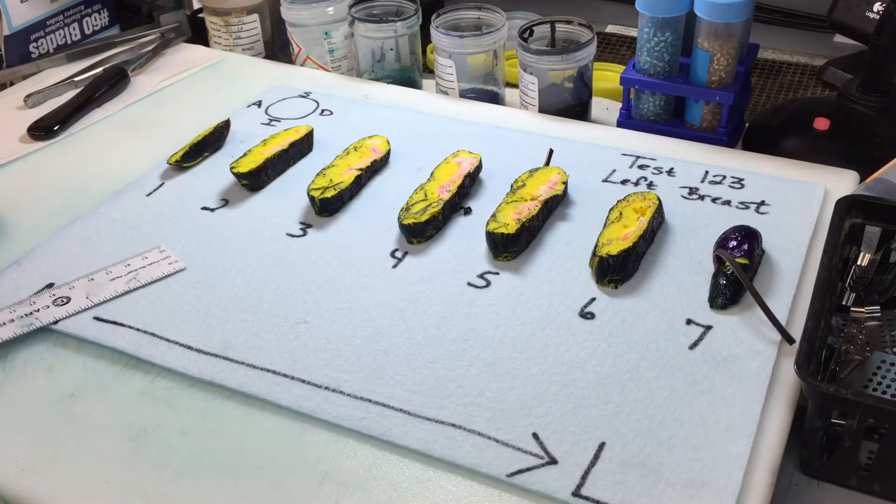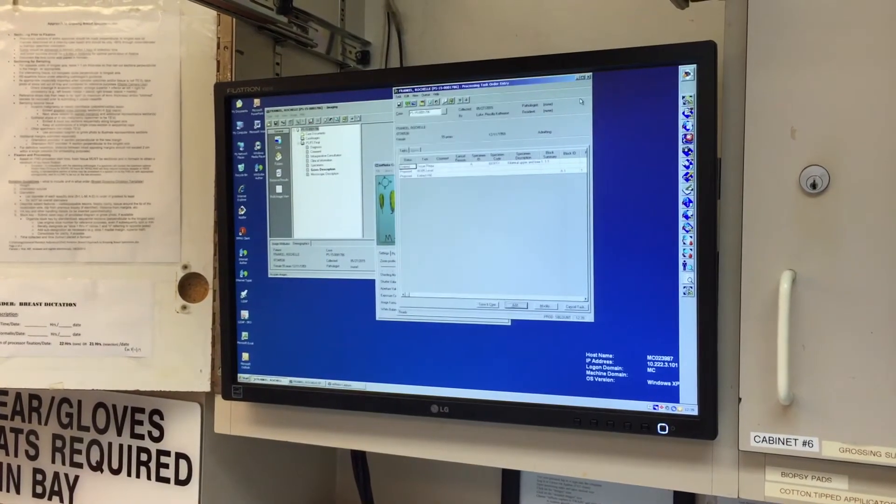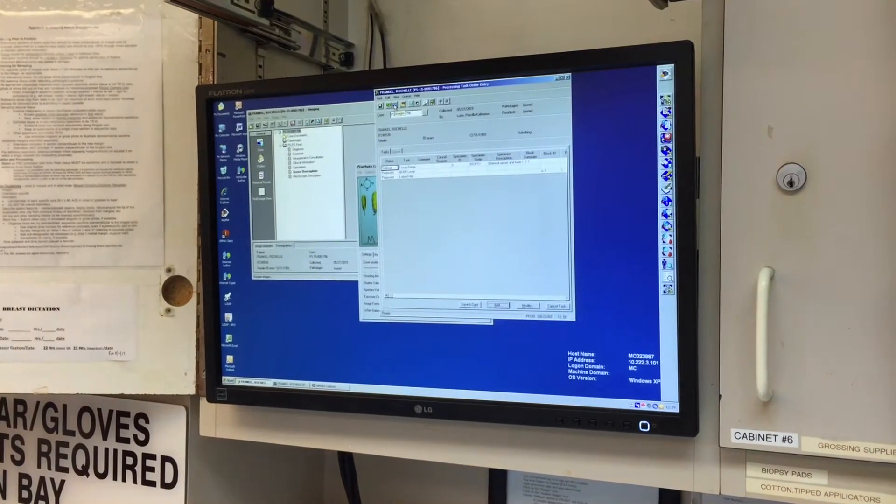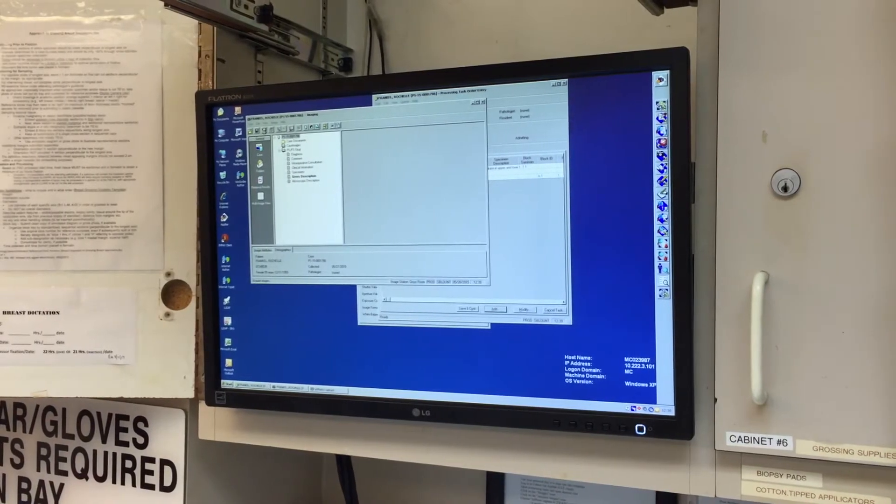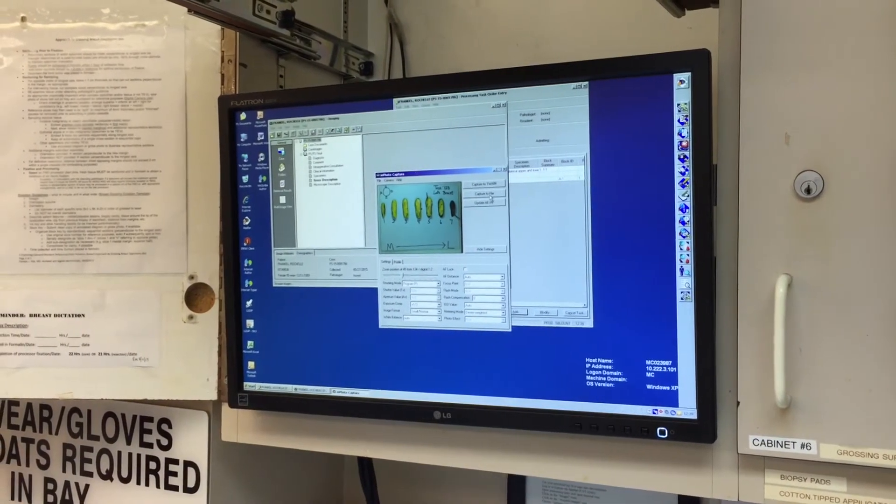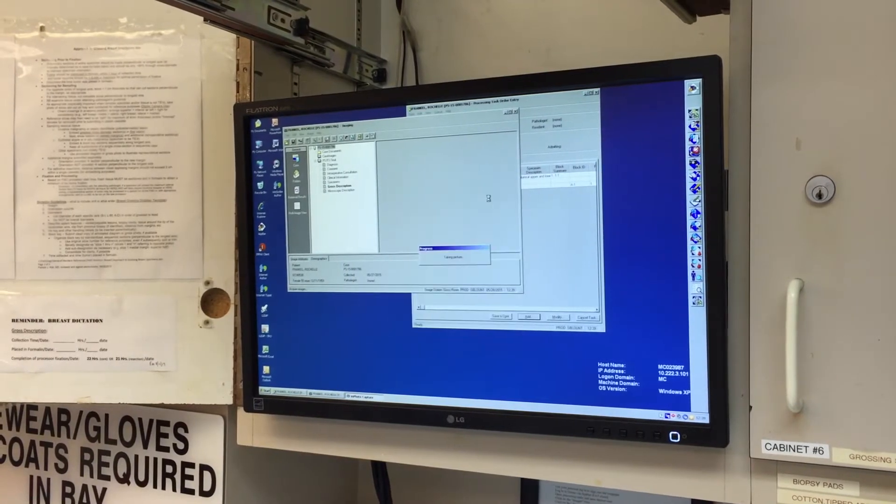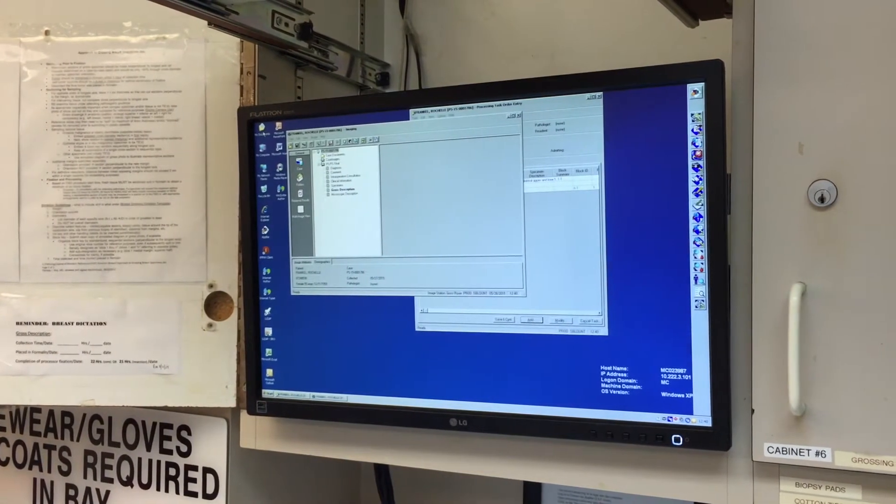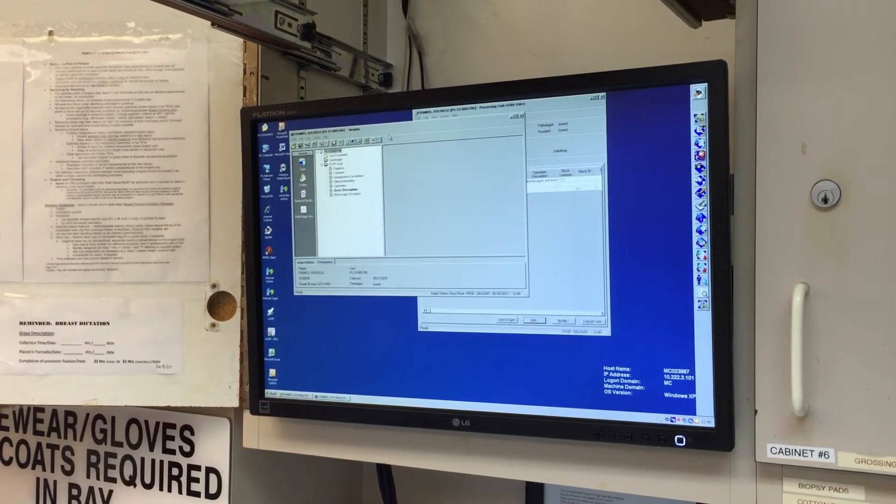So now that you have your slices laid out, this is when you want to take a picture. Okay, so to take a picture, you open up Processing Task Order Entry, which is the box that looks like this. And then you click the icon, which is the blue mountain, which is images. And then once images comes up, you click the double black box to be able to acquire the photo. So then this picture comes up and you're going to take two pictures. One you're going to capture to file, which will go to the case and capture to twain to go into Cerner. So when you capture to file, it will go to your documents and then you can open my documents and find the picture and you will print two so that way you can draw your block key out on your picture that you've taken. And that's the end of part two.